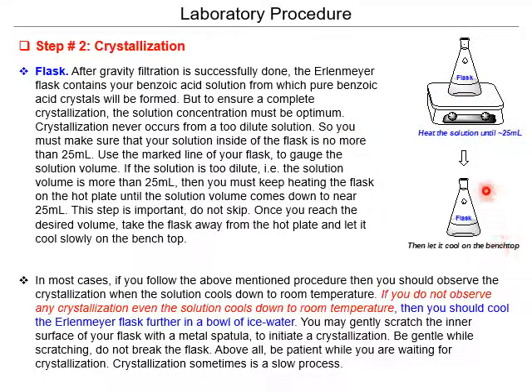After that, you need to let the solution cool to room temperature. When it is cold, you can see the crystals of the benzoic acid, but you need to be patient and wait for crystallization. Crystallization sometimes is a slow process. In addition, you can use a metal spatula to gently scratch the inner surface of the flask. This will help the crystallization rate be a little faster.